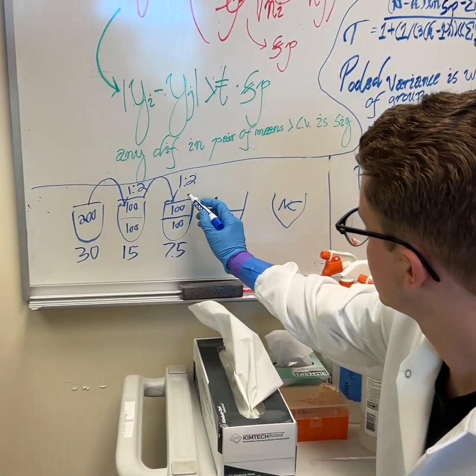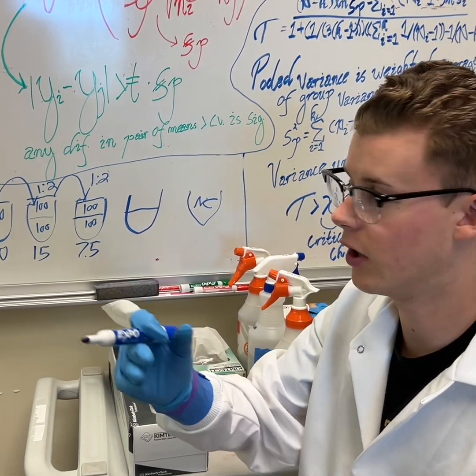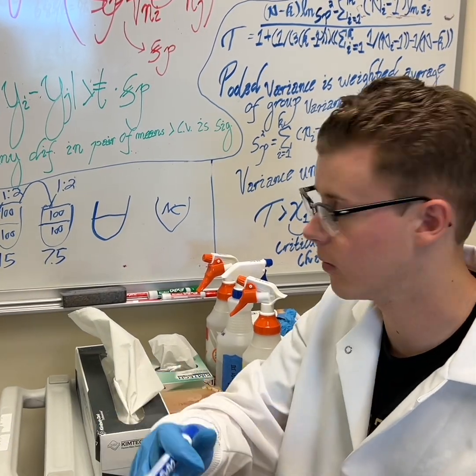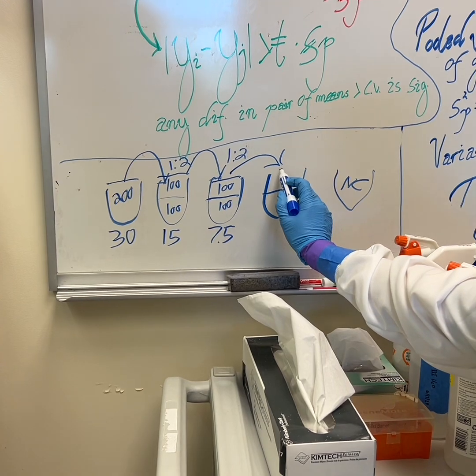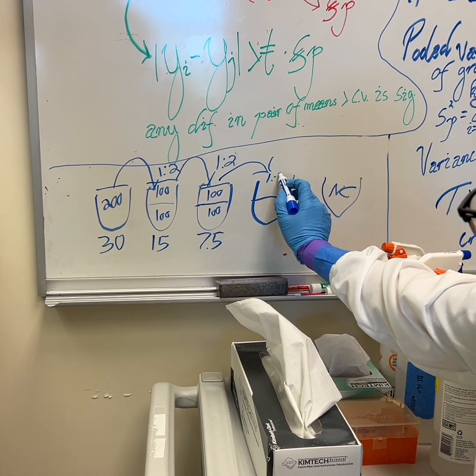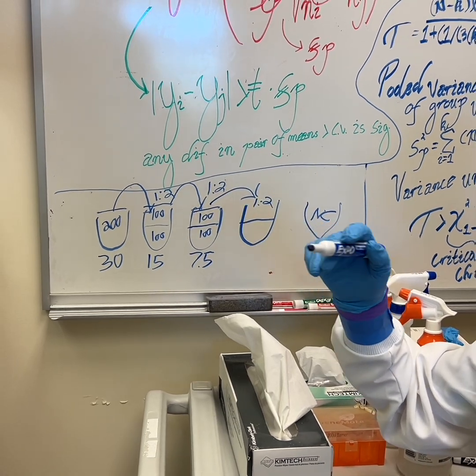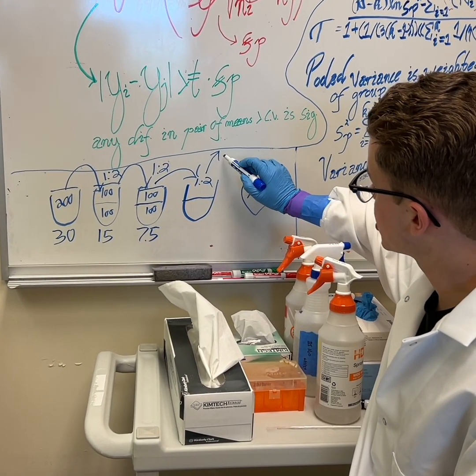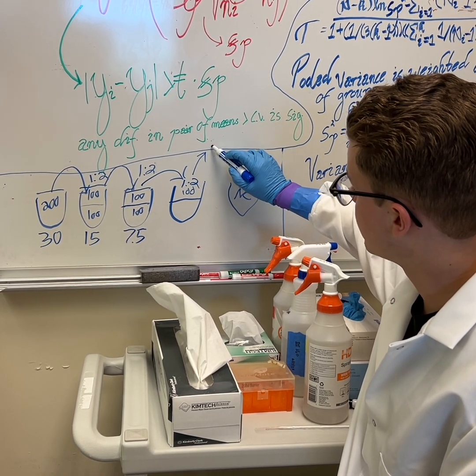Okay, so in other words, what is the minimum amount that we need to disturb the biofilm in order for it to be effective, so that we're not over-prescribing? And then you'll do that to your last one, besides the positive and negative controls. Sorry, you're not going to add any to the positive control. And then the last 100 microliters is going to go out to the trash.